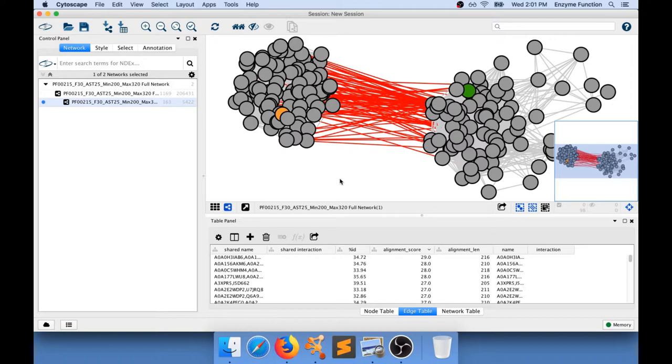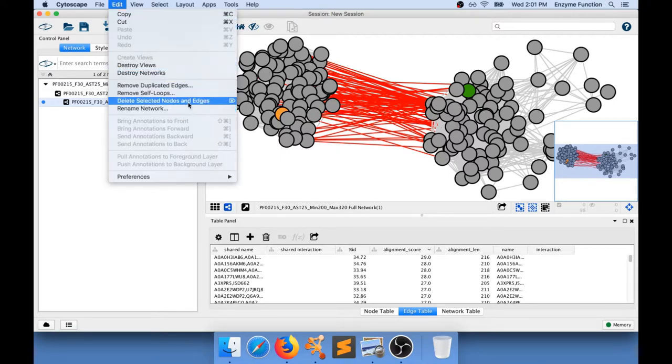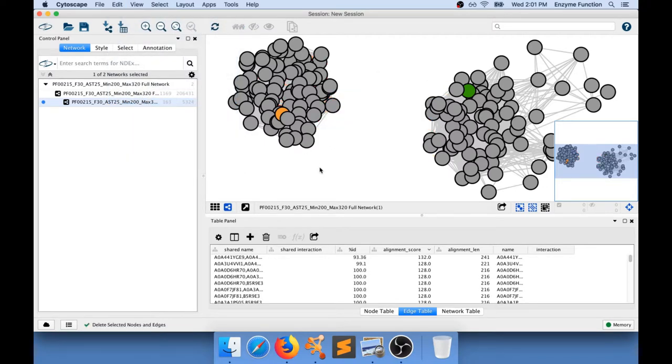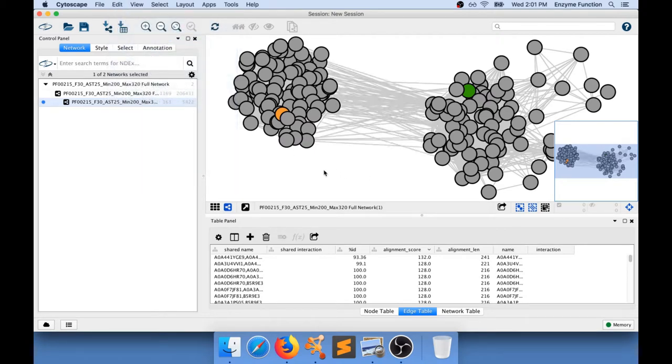When you work with a daughter network you can for example edit the network. So for example I can go edit and delete selected nodes and edges but I've only selected edges in here. If I do that I'm going to basically cut that network apart. This is not exactly what I want to do.